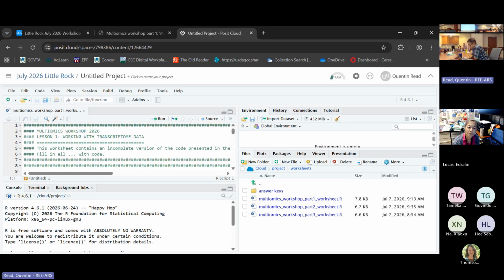Okay, let's see. You already did it. Let's see for a second. How does this work? What do you have already installed? Oh, it's not. You can see all the libraries. Yeah, it's already on there, so that should be good. This is just to make sure it's all good. That's because it's fill in the blank. So your package, okay, cool. Thanks, you should be good. It'll take a second, so you can see what packages are loaded on this page.